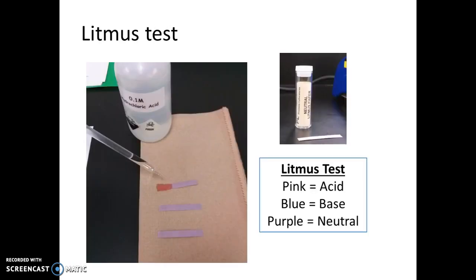The next test is a litmus test. Get three strips of litmus paper and arrange them on a paper towel. Instead of dipping the litmus paper into each solution, put drops of the solutions onto the litmus paper. You only need three strips because you can test two solutions by putting a drop on each end of one piece of litmus paper.